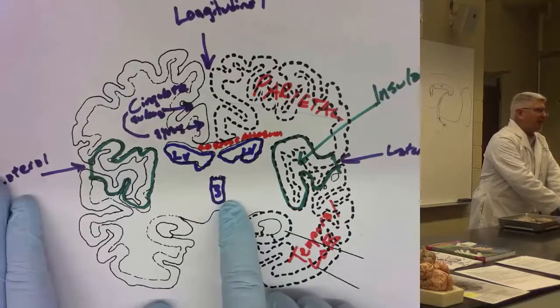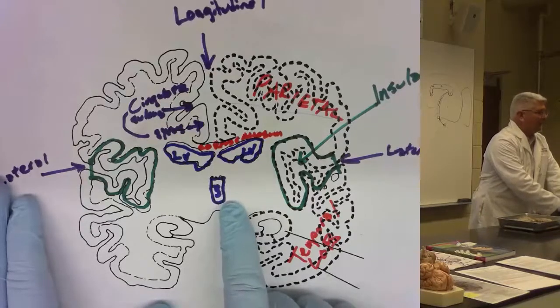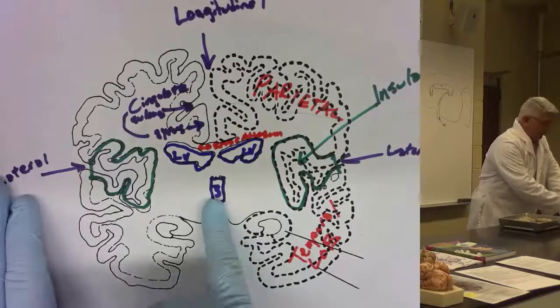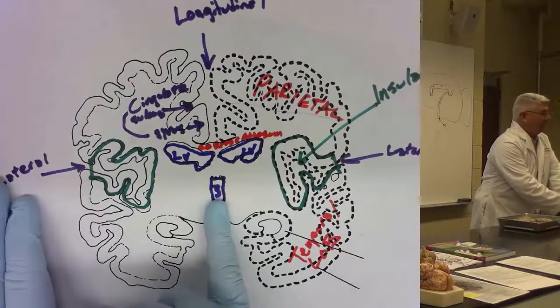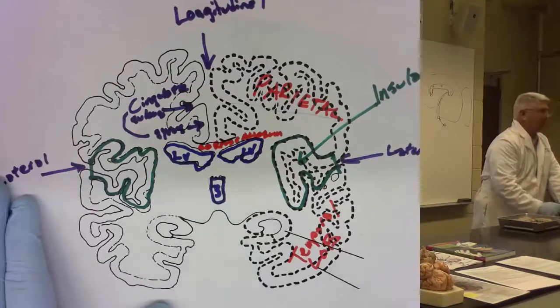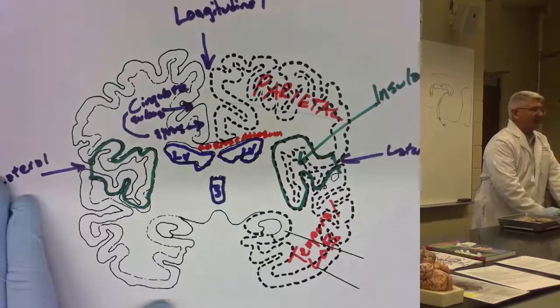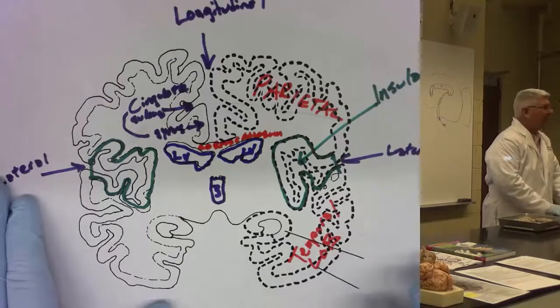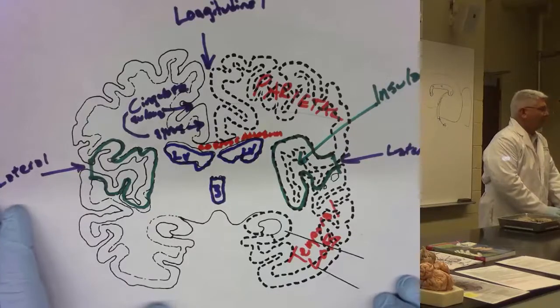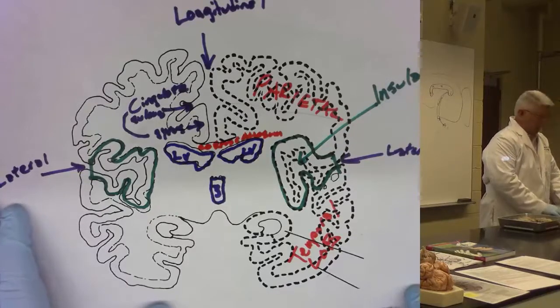So in the human brain, sometimes we don't get that really nice T shape because it's a little bit smaller than in the sheep brain. But it's the only ventricle that's going to be on the midline in the human brain that doesn't look like a little pipe. And I don't think we have a good coronal cut of the cerebral aqueduct in the human slice. And this is sort of the section that I like to use to mark things.